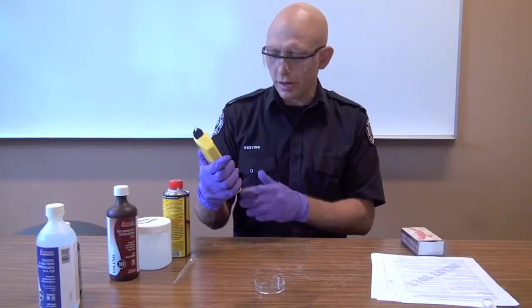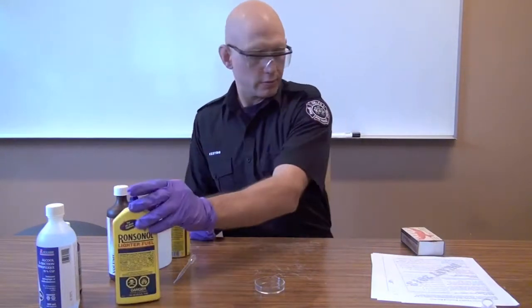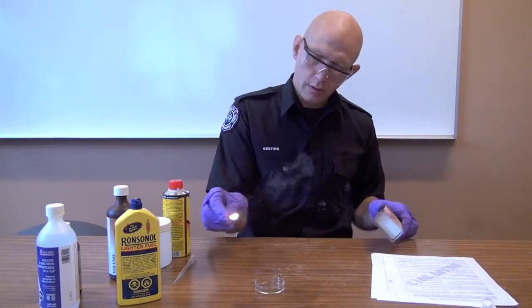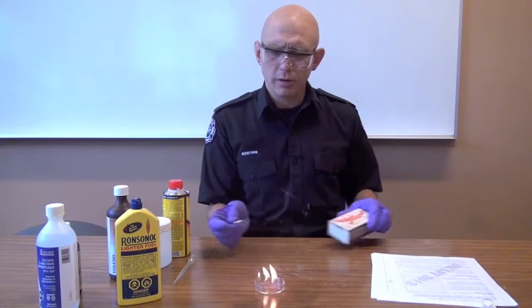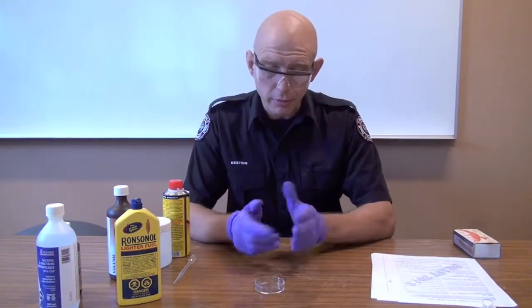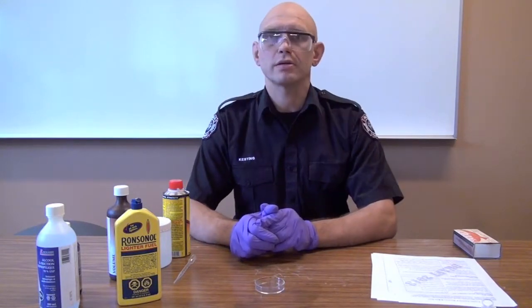Let's try ronsonol lighter fuel — a light petroleum distillate. Coming in from the side, and yes — it lit up long before the match got to the actual liquid. Burned out quickly. Smoke: not too much. Flame: yellow. Excellent information to have.